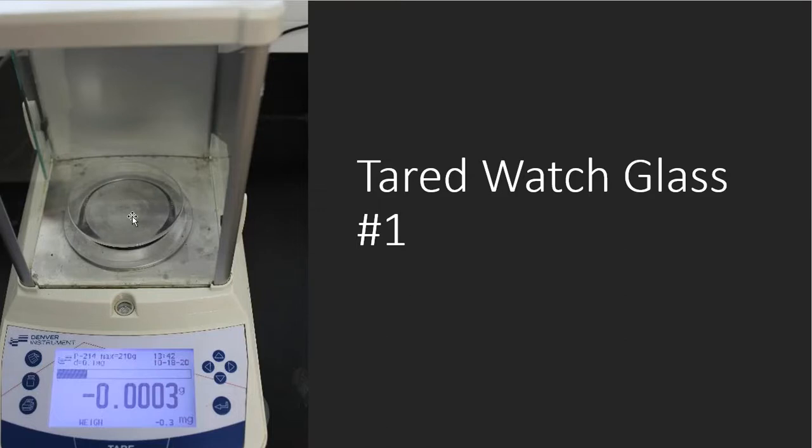Okay, so I go to the balance and I put a watch glass here. This is what I always do because those filter papers have that product, and when I transfer that over to a balance, I don't want my stuff just to swoosh out everywhere. So my watch glass is going to be a little plate for me to scrape that stuff off onto, if that is what happens to me. So the tared watch glass, there it is.